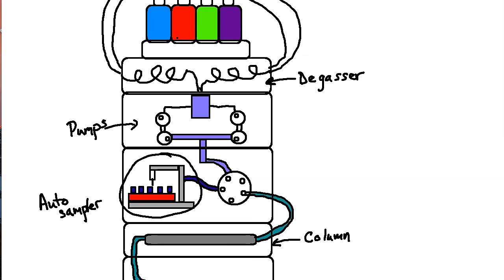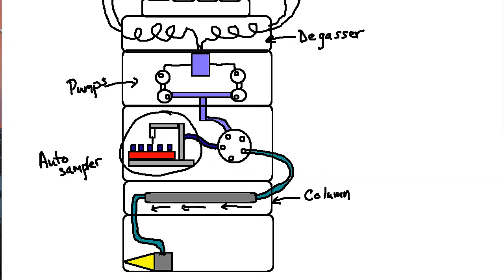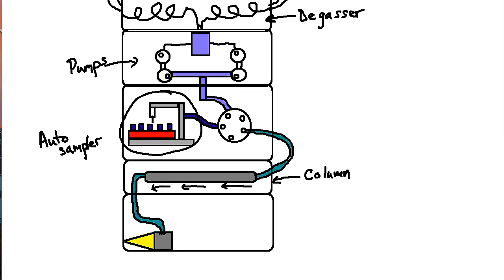It's continuously pushing the mobile phase along. So your materials will start traveling on the inside of your column at a given rate. And we've talked about the inside of the column and how that works, the adherence. And then at some point, they will come off of the column. They will be sent down into the detector. Again, your detector could be fluorescence, it could be UV.